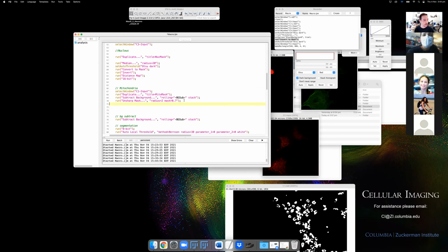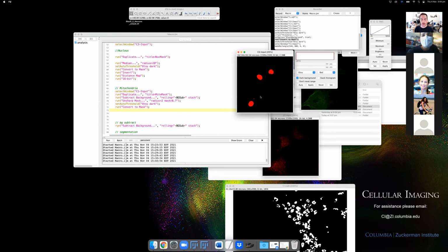We have to do the thresholding. That was just, again, a simple Otsu threshold. So we can just copy this actually. Okay. Yeah, and actually then we want to analyze these particles. So just like before, we had this, but we want to analyze them. And so a couple of things we want to do.